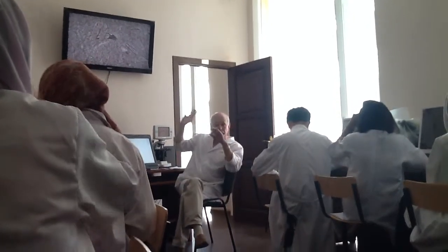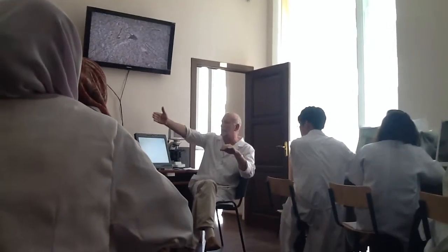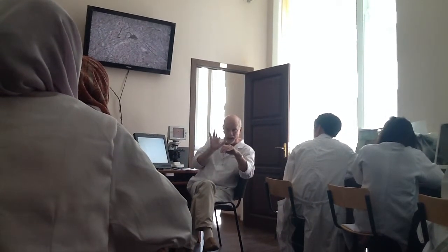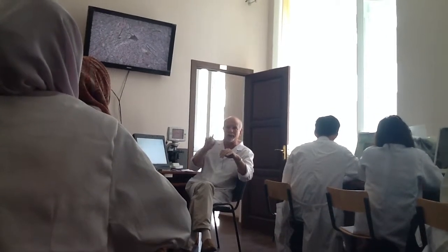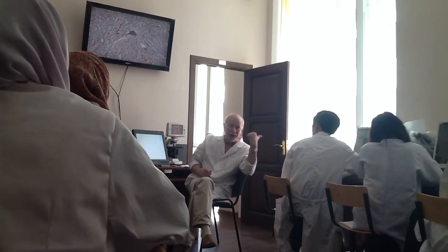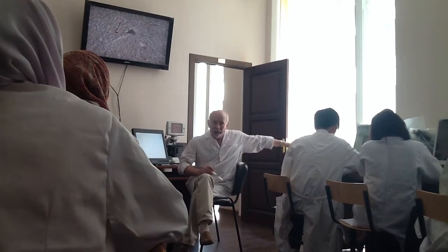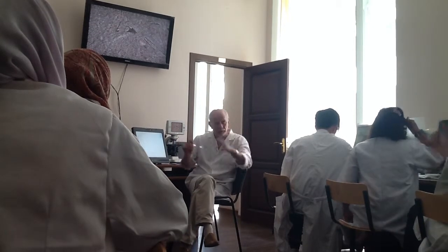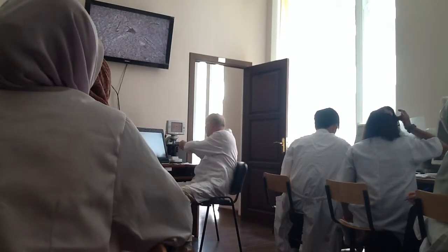Well, so it's the first slide. You will examine it and compare it with the microphotographs in your atlas. Unfortunately, we have only 5 slides for cerebral cortex and 5 for cerebellar cortex. I'll explain briefly the next slide, but you can revise spinal cord and ganglion if you want, slides are present here. During the hour that we have, you will examine the slides. But now, the cerebellum.